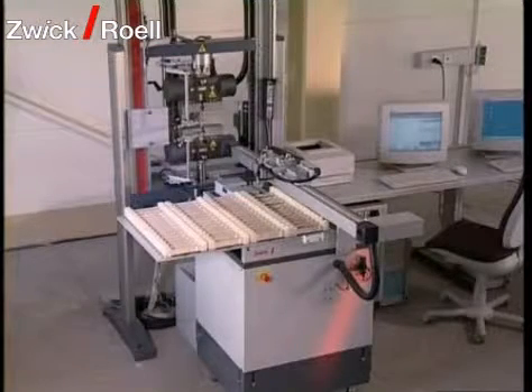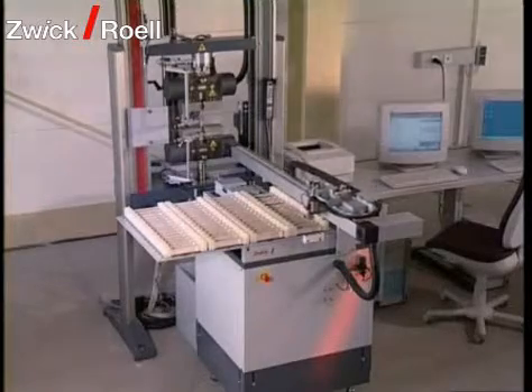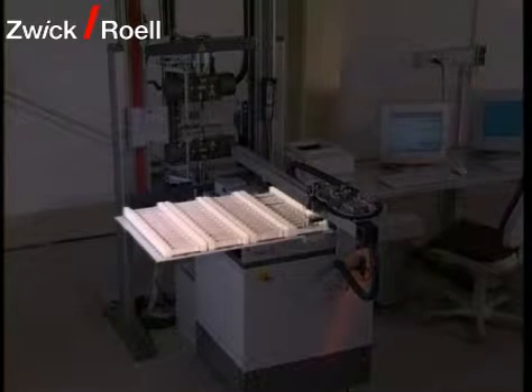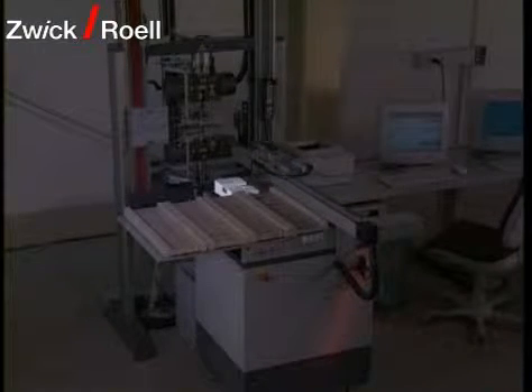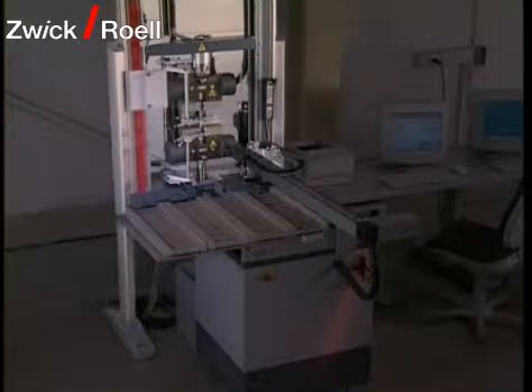A testing system in X-Linear construction consists of the following functional units: the X-Linear feeding system, the magazine table with specimen carriers, the cross-section monitor and the barcode reader, as well as the testing machine and the extensometer.